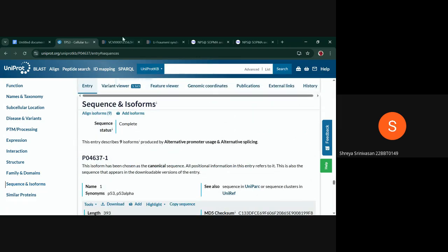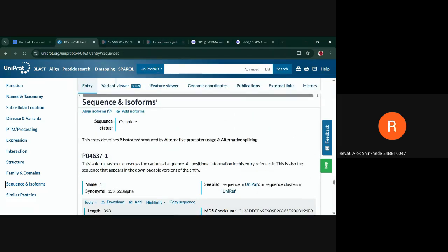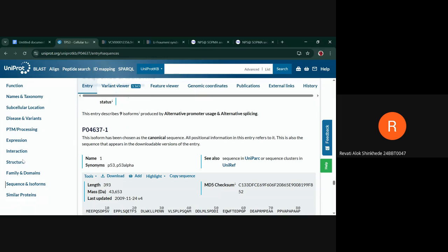And then also here we can check if it's pathogenic or not. Like if something we're analyzing is very popularly studied, then we can immediately at this point in our search analyze if it's going to be pathogenic. And there we learn the different tools where we can consider different viewpoints of considering the sequence we're working with. And then after this, yes, go ahead.